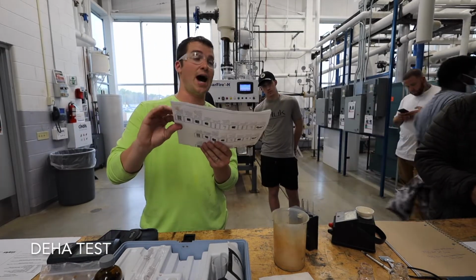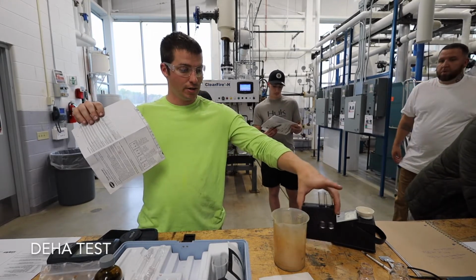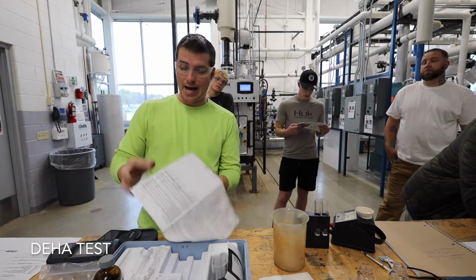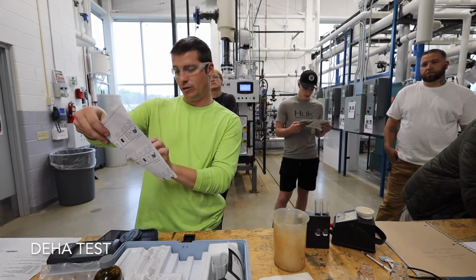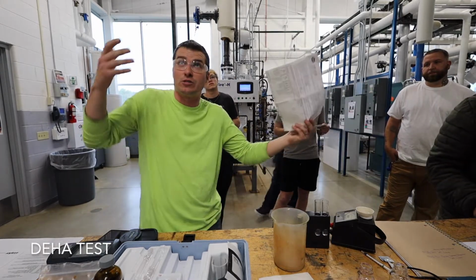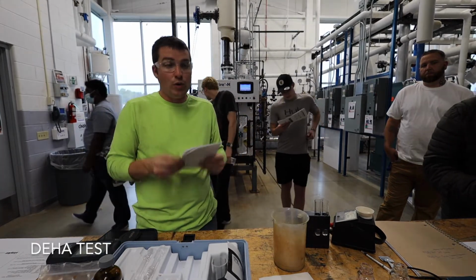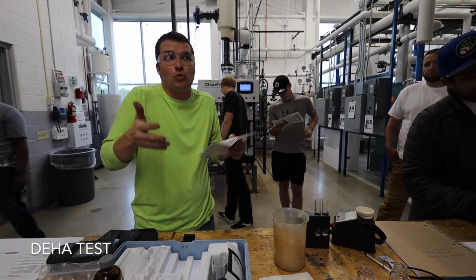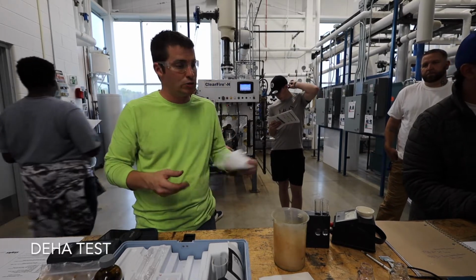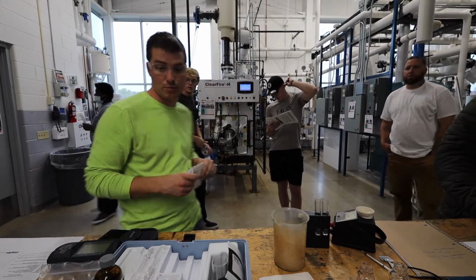And remember, we ran the high range test, all right? So we need to take our answer here. So let's do 10 actually for easy math. 10 times our multiplication factor, which is 17 on the high range test. So what's 10? 170, right? So if it was 5, that's half of 170, right? So again, we want to be like 300 to 500. So obviously we're low. We need to do something about that, right? And how we're going to do that on this is we're going to run more of that product specifically.